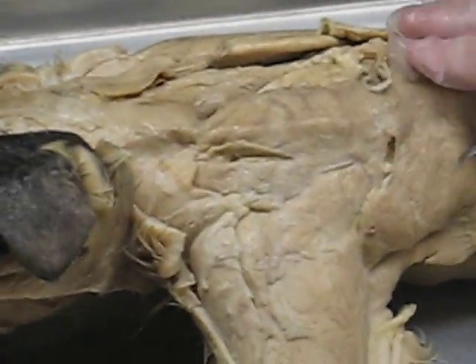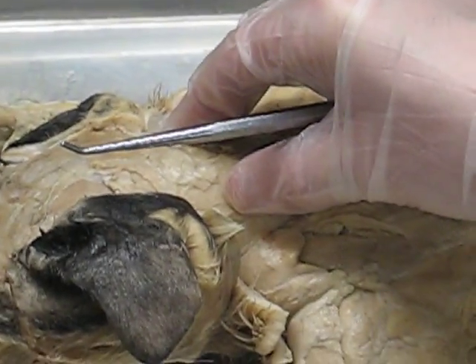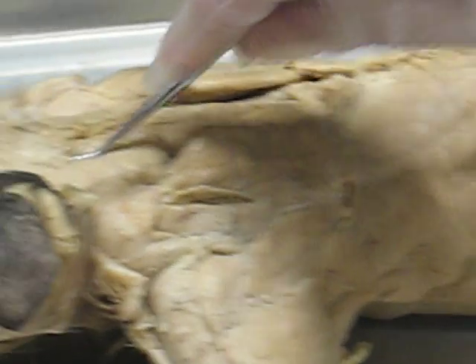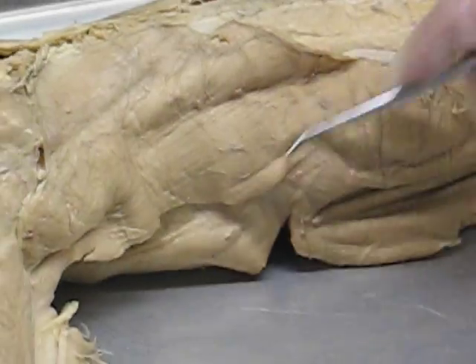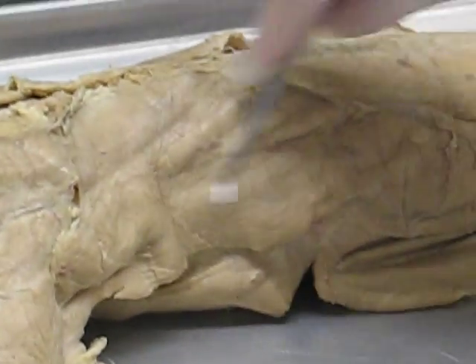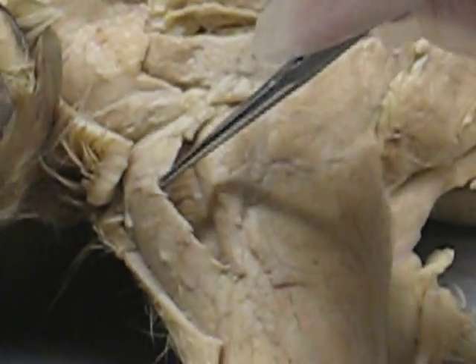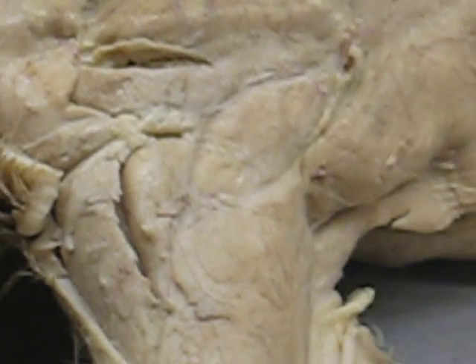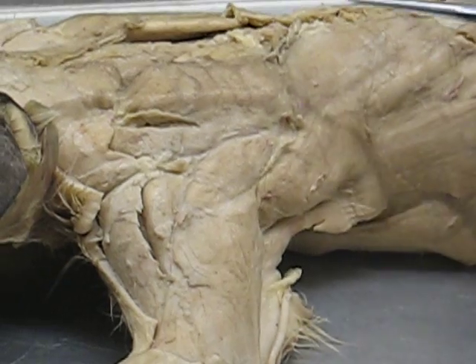Now we come to the back muscles. We have the clavotrapezius, which is the superficial muscle in the back of the neck. Then you have the acromiotrapezius, and then the spinotrapezius. You can see the latissimus dorsi here under the spinotrapezius — all of this is latissimus dorsi, the whole side of the back. And then you have the three deltoids: you have the clavodeltoid, which is like a flap that covers the arm; this triangle here is the acromiodeltoid; and this oval shape is the spinodeltoid. So it goes clavodeltoid, acromiodeltoid, spinodeltoid.